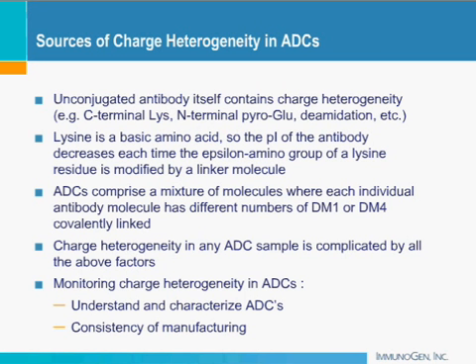And lastly, for method development, we have an example wherein a component of the formulation buffer was interfering with the analysis. Here you have the same ADC molecule that was analyzed in two different formulations. On the top, we have an acetate formulation, and we see there's a very nice separation of charge-based species. But in the bottom figure, this was the ADC sample in a histidine formulation.